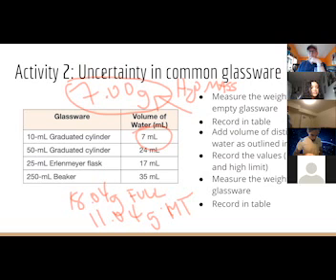Oh, you would divide by the density? Right. I take the mass and I convert it to a volume using the density, precisely. But how do I know what the density is? Using the temperature of the water? There you go. Right.